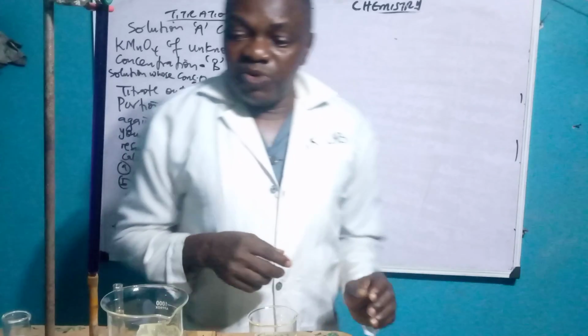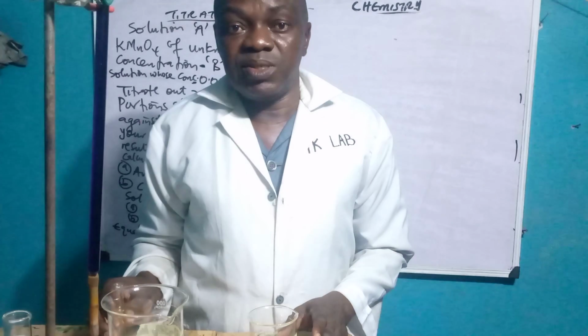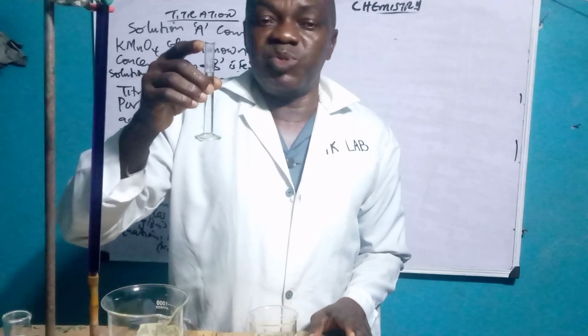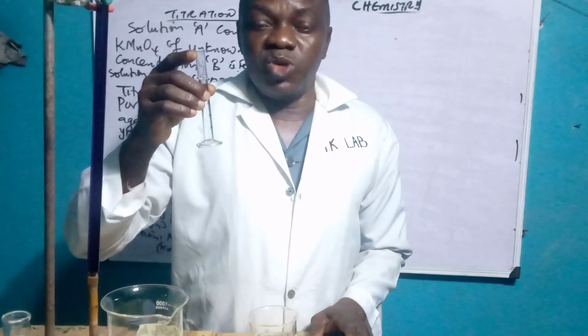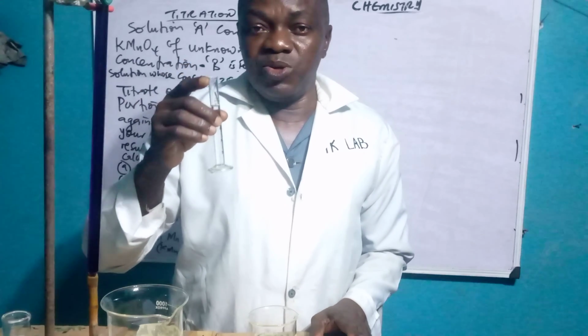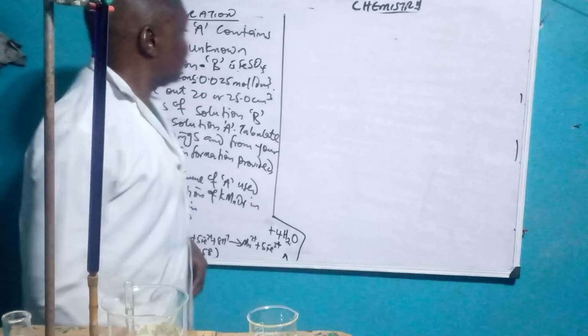But remember, before you can carry out this titration work, you must acidify it using 10 cm³ of H2SO4, which was taken from 1 molar solution of it. So let's see how the question goes, so that I'll go straight to the point.